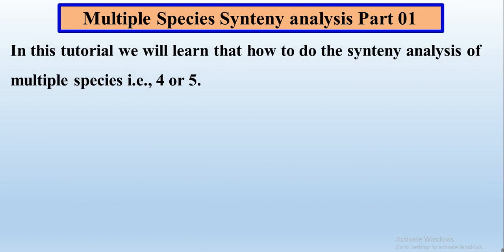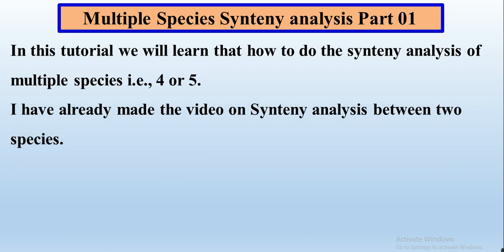In this tutorial we will learn how to do the synteny analysis of multiple species — more than two species, like three, four, or five species. I have already made a video on synteny analysis between two species. The link of that video you can find from here. In this video we will talk about the collinearity or synteny analysis among multiple species, more than two.